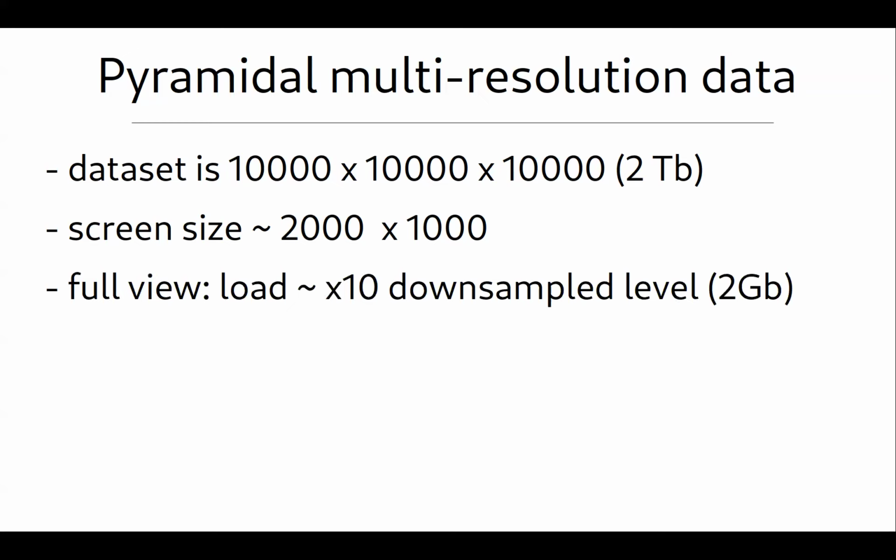The view will be pretty much equal if you load just a tenth of that sample data, just because of the screen resolution. So there is no need to load all 2 terabytes. You can just load 2 gigabytes, which is a specific resolution level already in that file.